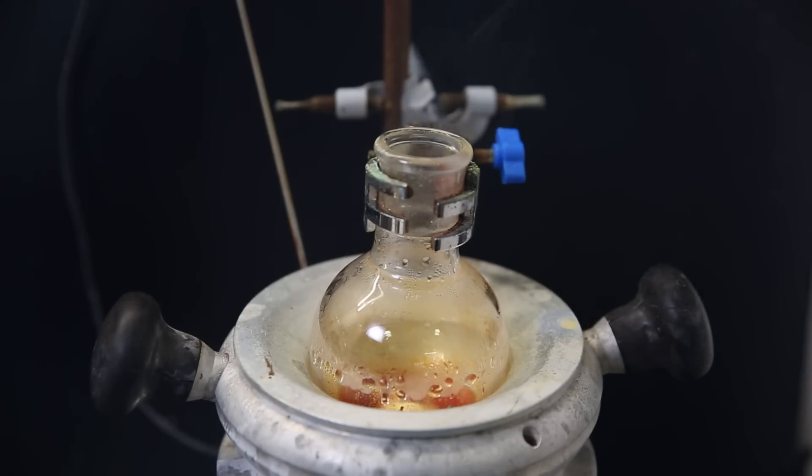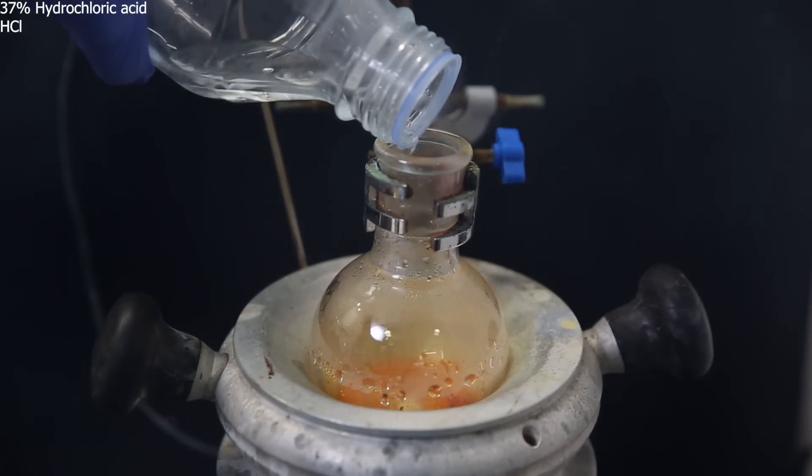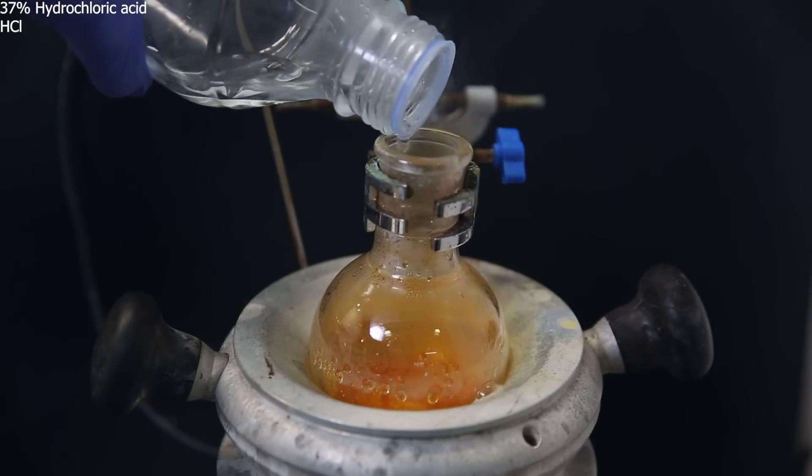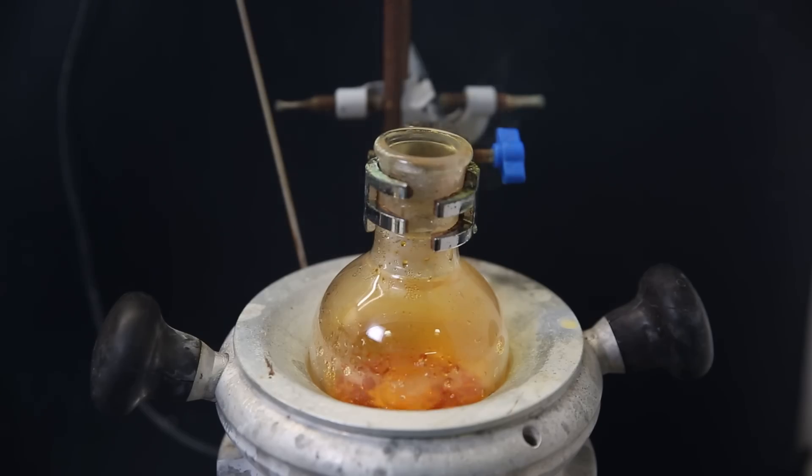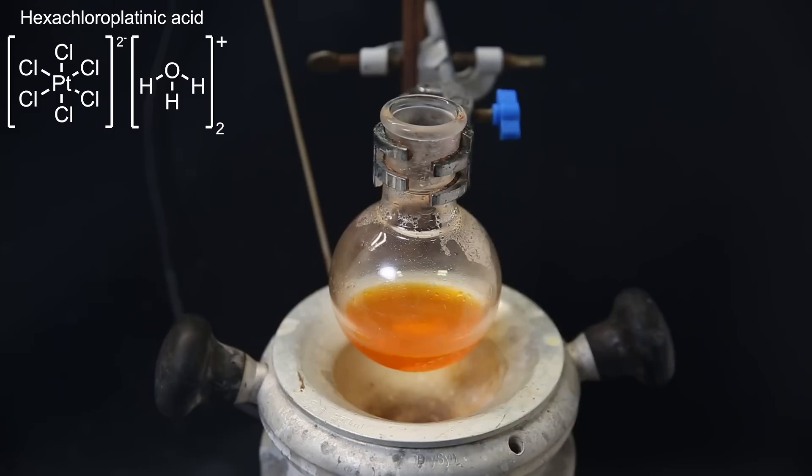When all of the platinum had dissolved, it had also concentrated down because it was boiling, and it is a red solution. To remove any remaining nitric acid and dissolved nitrogen oxides, I add some 37% hydrochloric acid, and we see some orange nitrogen dioxide bubble out immediately. I do that twice and distill part of it off to distill out all of the nitric acid. When that is done, I am left with a nitrogen-free solution of hexachloroplatinic acid.